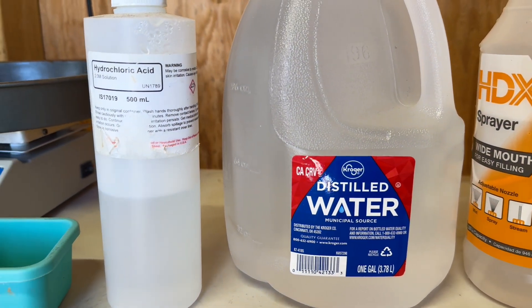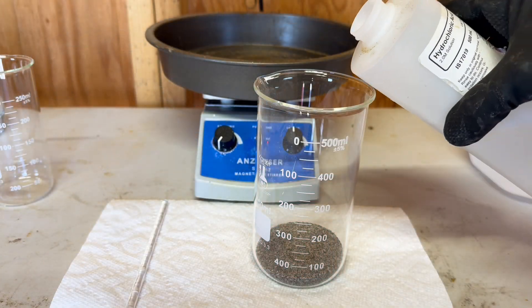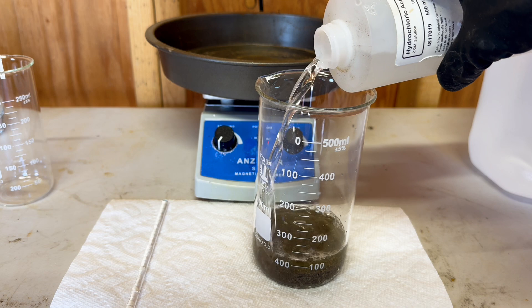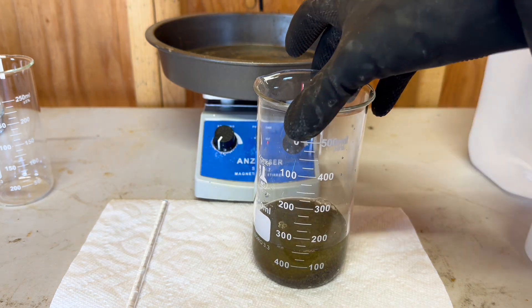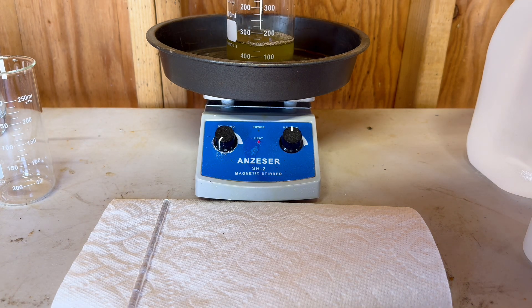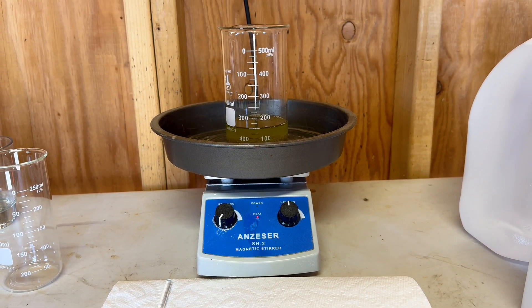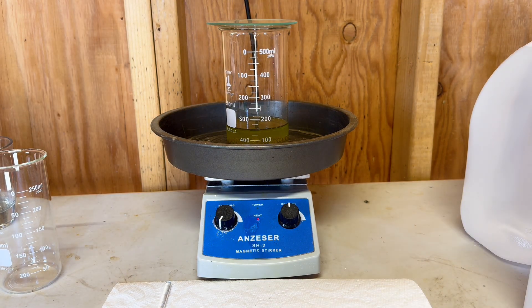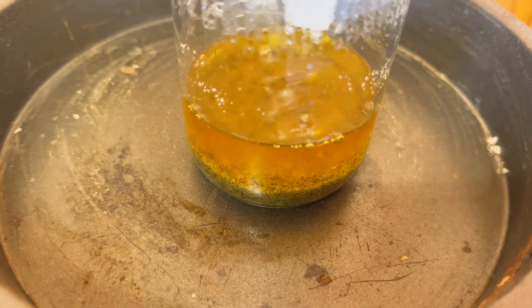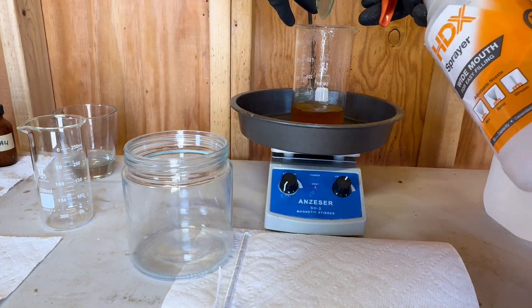We are going to use 150 milliliters of hydrochloric acid to clean our black sand concentrate. We are going to boil and clean our concentrate. The hydrochloric acid will clean out some quartz, some iron stone, and other materials that might be in the concentrate.